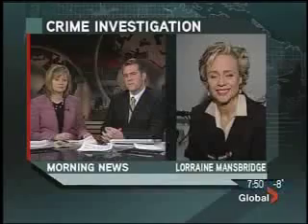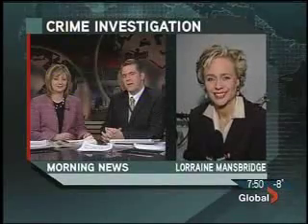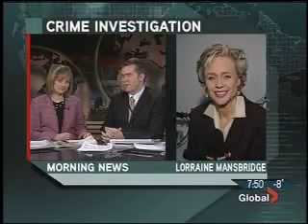Yeah, 7:50 now as we head back over to the Forensic Laboratory Services for the RCMP. Lorraine is there this morning giving us a behind-the-scenes look at the incredible work that goes into solving a crime.